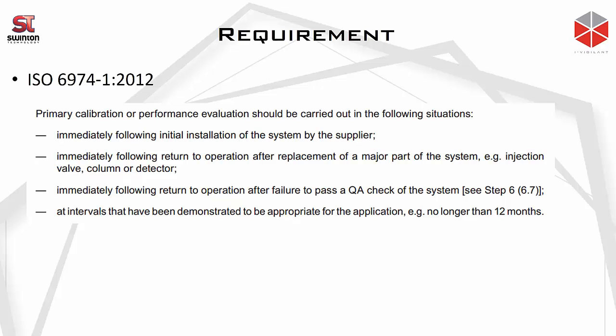So, and also at the intervals that have been demonstrated to be appropriate for the application. Basically, it says that every 12 months or so in this particular example, we need to perform another ISO 10723 test.